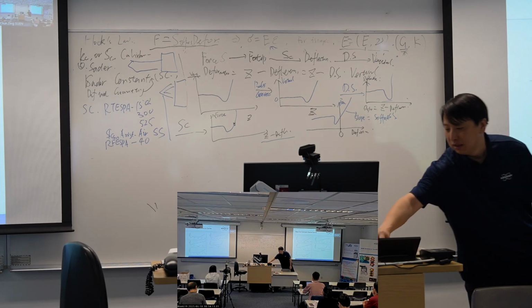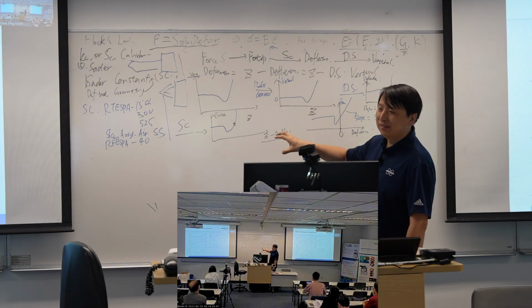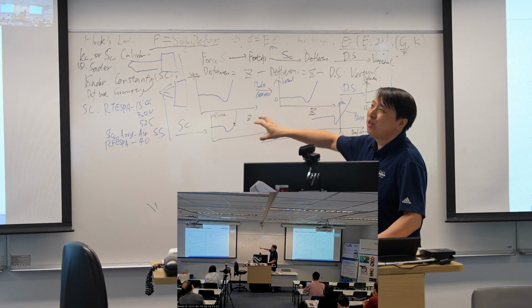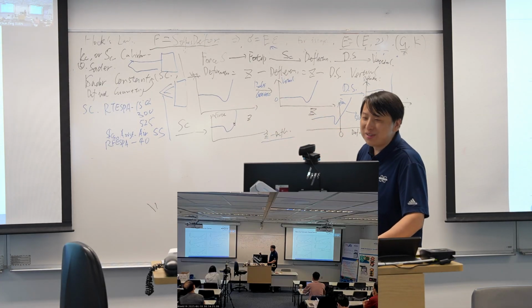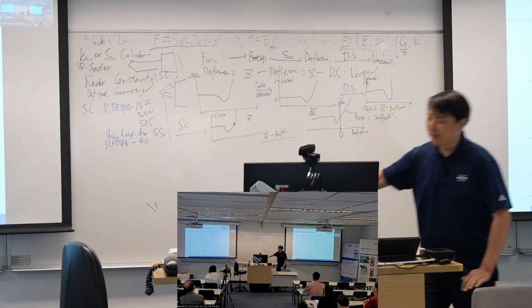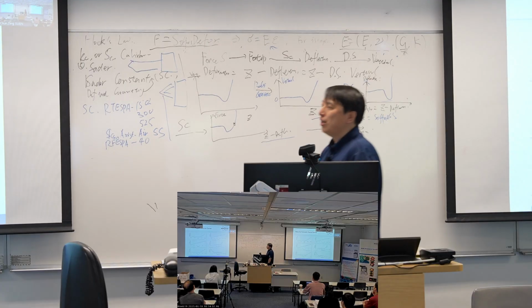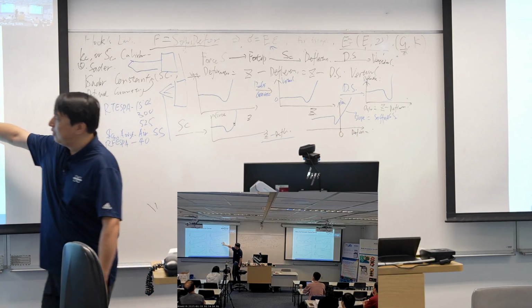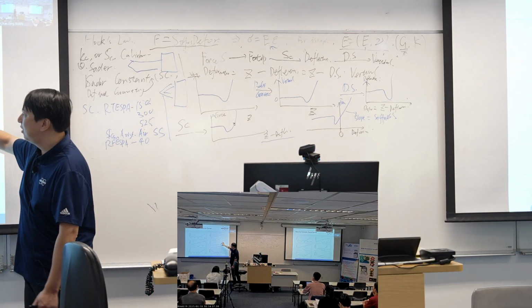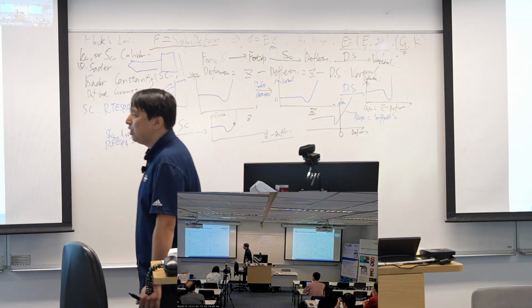But the Bruker software did some stupid things again. So the Bruker, I'm sorry, the Bruker thought our users may not be able to understand this step. So they make a transformation of this curve, they sweep this curve into this kind of formation.